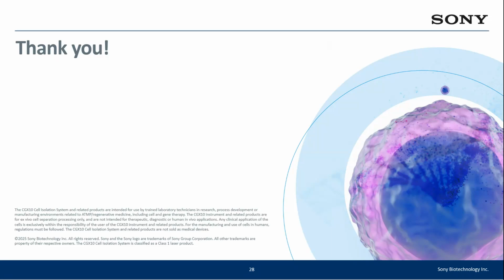Our next question says, please comment on viability of cells after CGX10 sorting. As discussed in the talk, we have tried the CGX10 system for a wide range of applications like CAR-T, CAR-Treg, and iPSC-derived stem cell therapies.